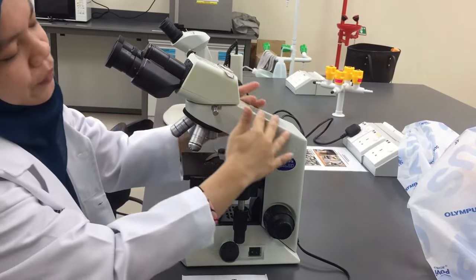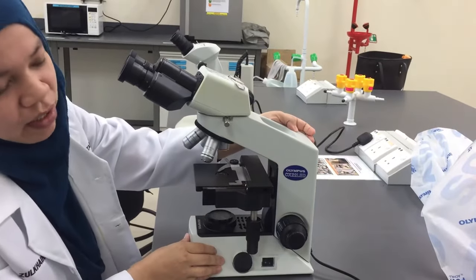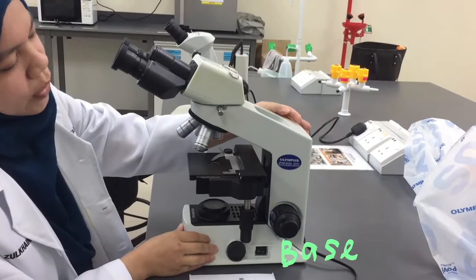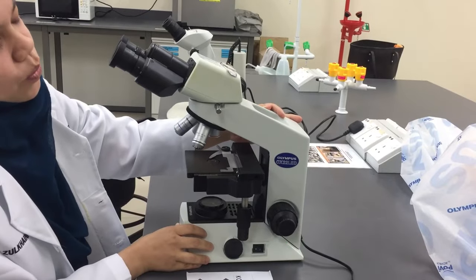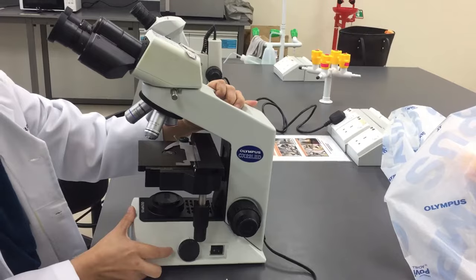As you go down, this is the arm of the microscope and this is the base of the microscope. When you want to hold the microscope, you need to hold the arm and also the base when you want to carry the microscope.